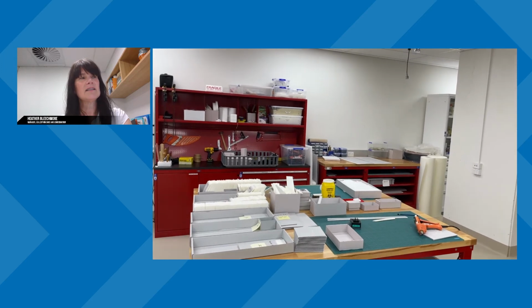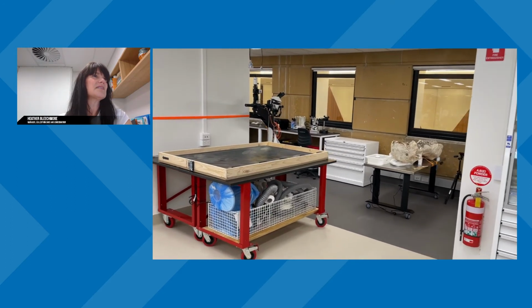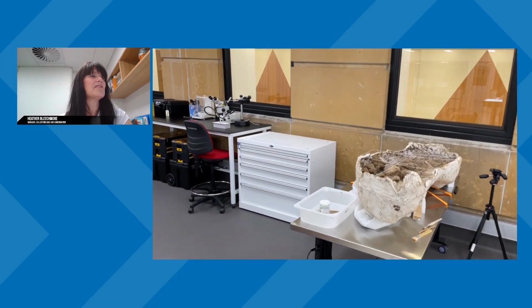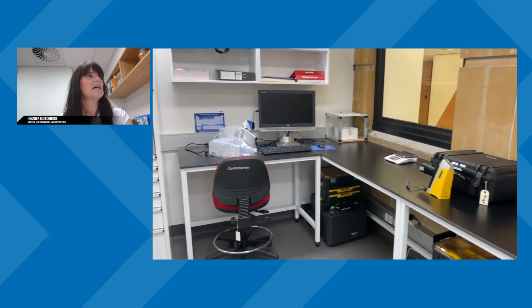And when we swing around to the right, we come across our box making station, which is where we make a lot of our housing for individual specimens using archival materials. We have a range of cardboards and foams and various tools to help us cut and make the boxes. This is towards the front of the lab, and on the left here is a painting that's been brought into the lab for a condition assessment, the Diprotodon jaw, which we'll get to a little bit later with Sheldon, so don't take too much of a sneak peek at that. And then this is our analytical area with some of that equipment that was up on the screen before, where we have microscopes, the FTIR, and the portable XRF machine. We also have up against the wall some of our pigments that we use and some of our dry chemical storage.